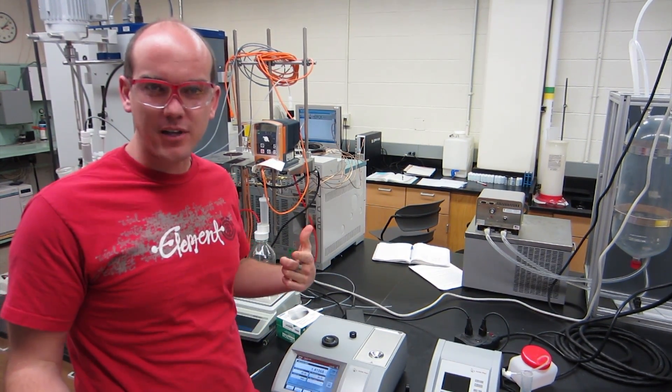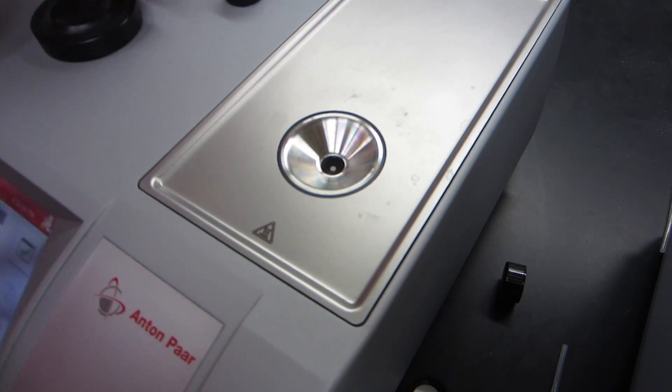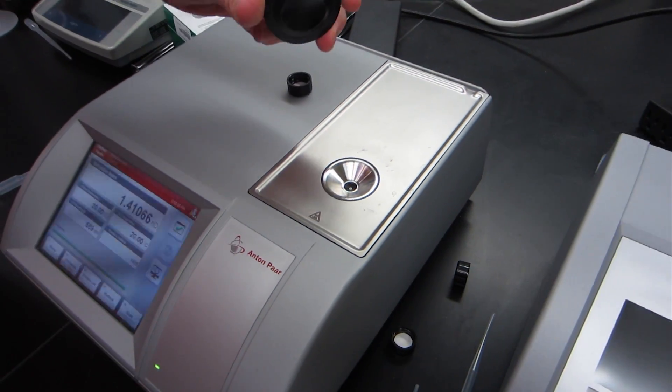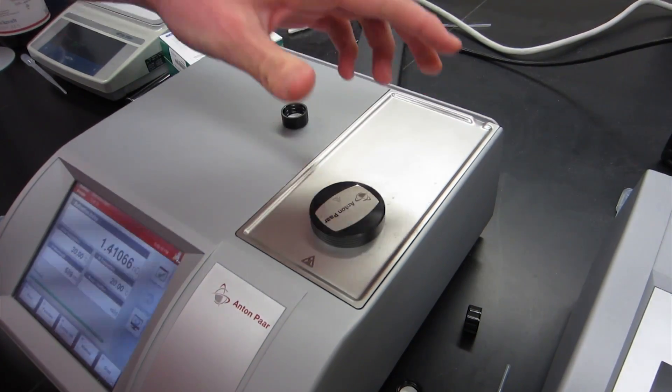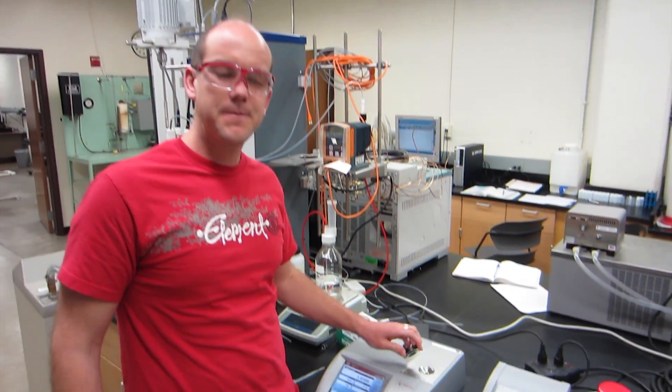After we take the samples of the distillate and the bottoms composition, we come here, we insert the sample into this receptacle right here, fill about halfway full, put the lid over it, and hit start. It'll give you the refractive index after which we go and we have an excel sheet provided to us on the problem statement and we use that to convert that to composition.